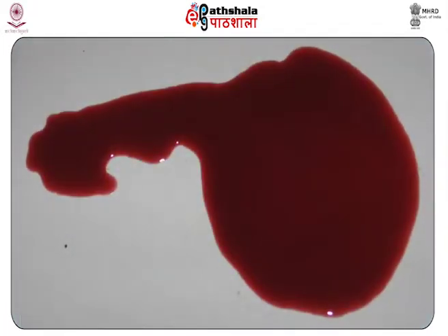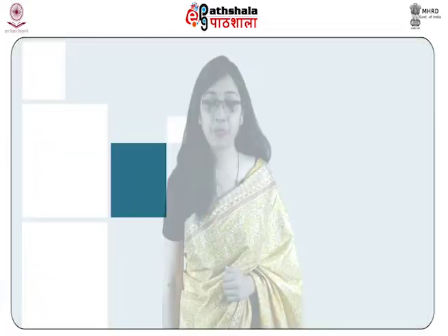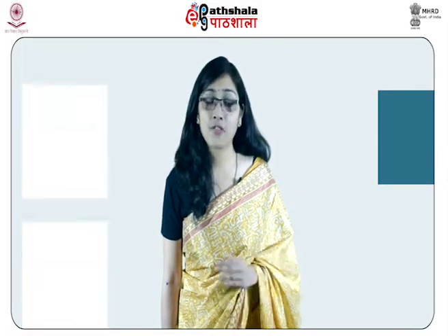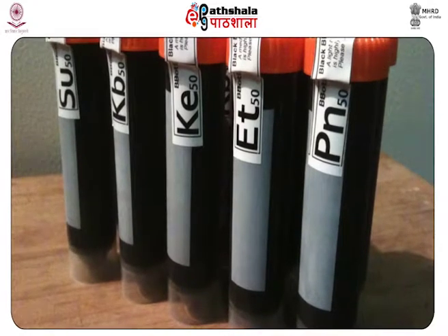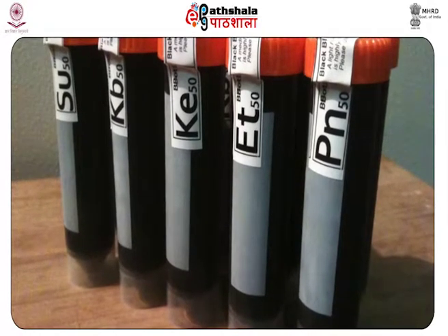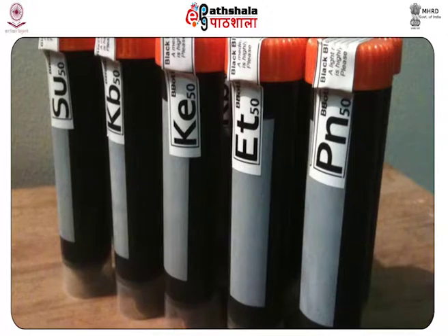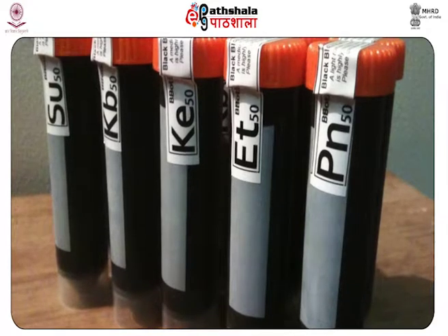The liquid blood is found at the scene in the form of blood pools. Two samples, each of 5 milliliters, are collected in clean vials. In one, sodium fluoride, oxalate or citrate is added and the other is kept without any preservative. It is preferable to collect and send the liquid blood in sealed tubes without the preservatives. The tubes are cooled in crushed ice contained in a thermos bottle and sent as such to the expert.